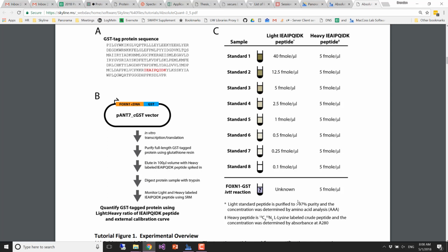There's sort of 2 ways in the proteomics community that people, or not 2 ways, there are probably many ways, but there is a simple shorthand way that people use to calibrate, where they'll inject a heavy peptide and then just assume that when the peak area of the endogenous is the same as the peak area of the heavy, then they must have the same amount in the sample. And then they assume a slope of 1 and an intercept of 0, so if the peak area of the endogenous is half the heavy, then the assumption is that, if you have very pure heavy, it must be half as much endogenous.